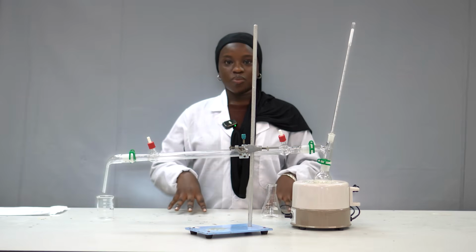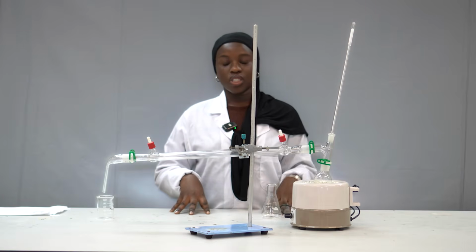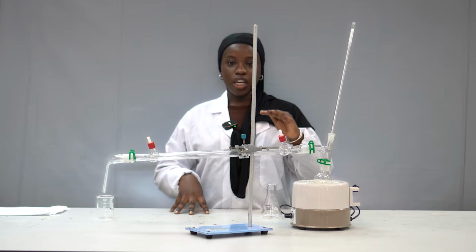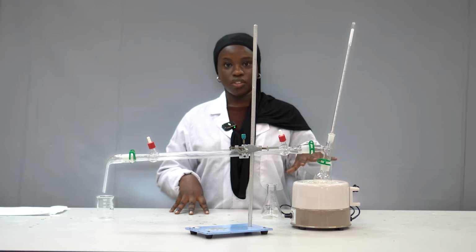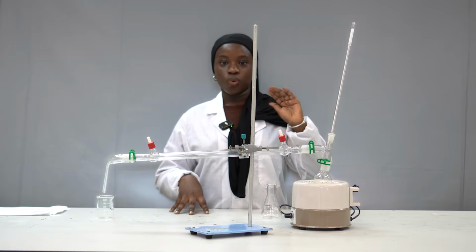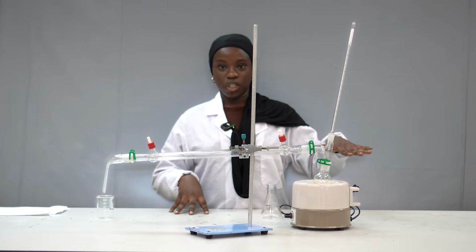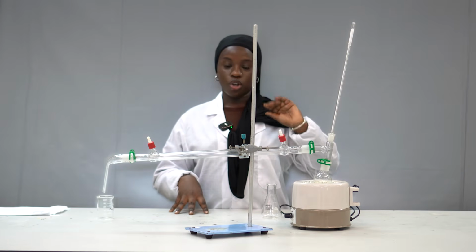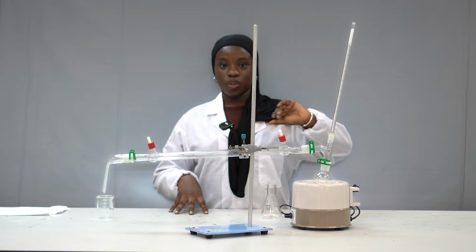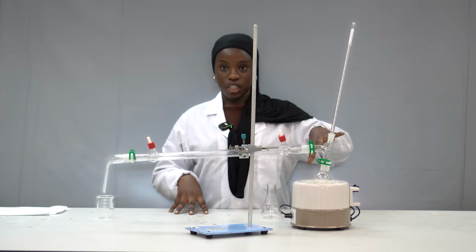Okay, it is hot at the bottom and cold at the top. As the vapor rises and cools, the hydrocarbons will be collected at different intervals. The hydrocarbons with higher boiling points will condense at the bottom of our fractionating column and will be collected at the lower levels, while our hydrocarbons with lower boiling points will rise to the top of the fractionating column and will be collected at the top.